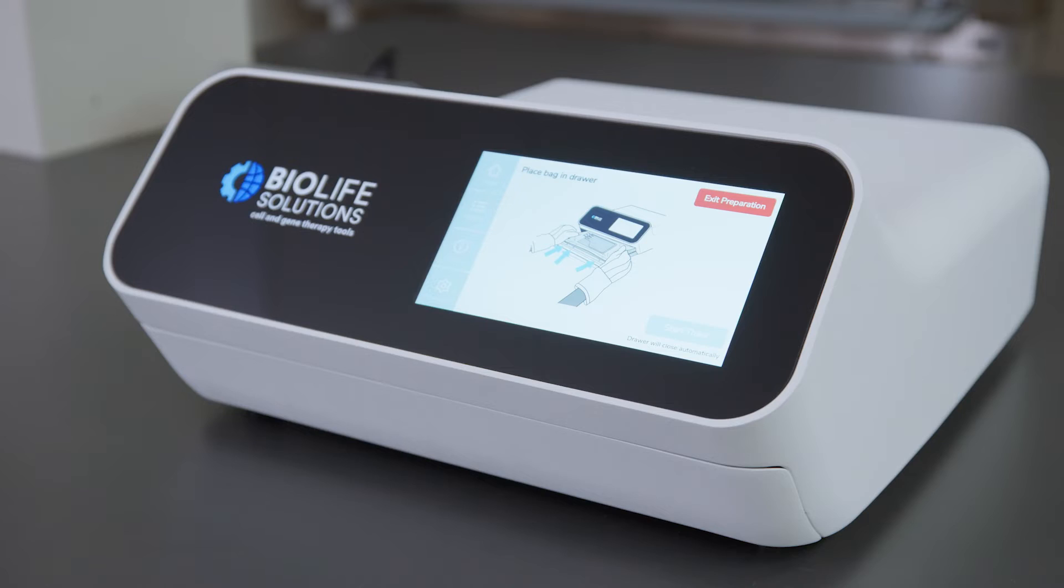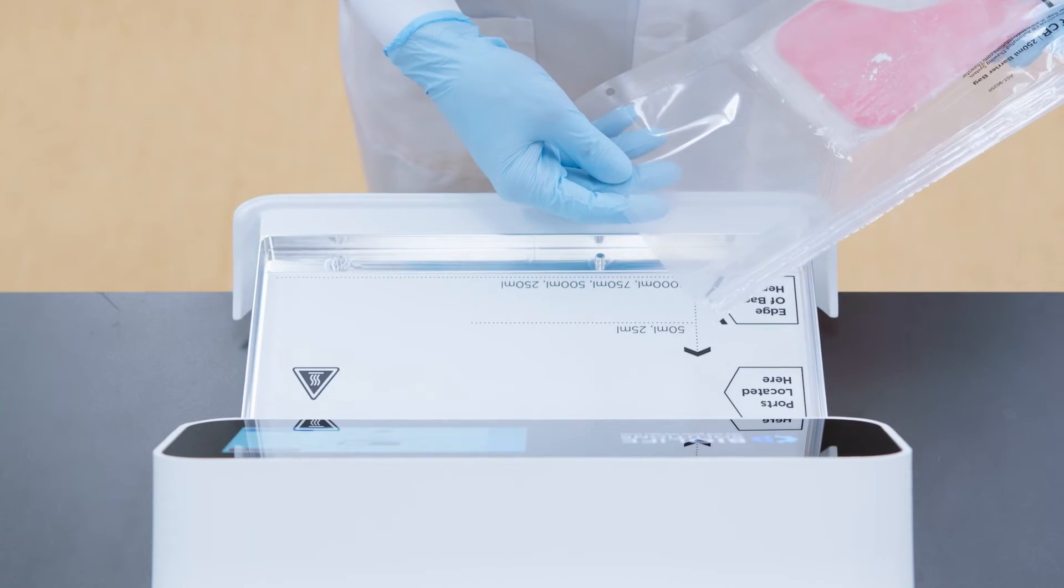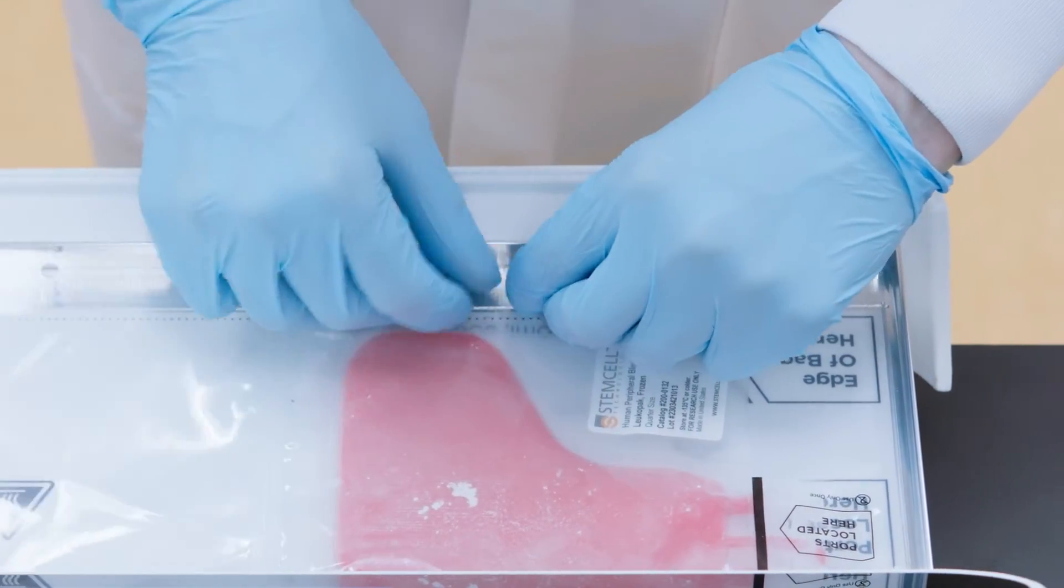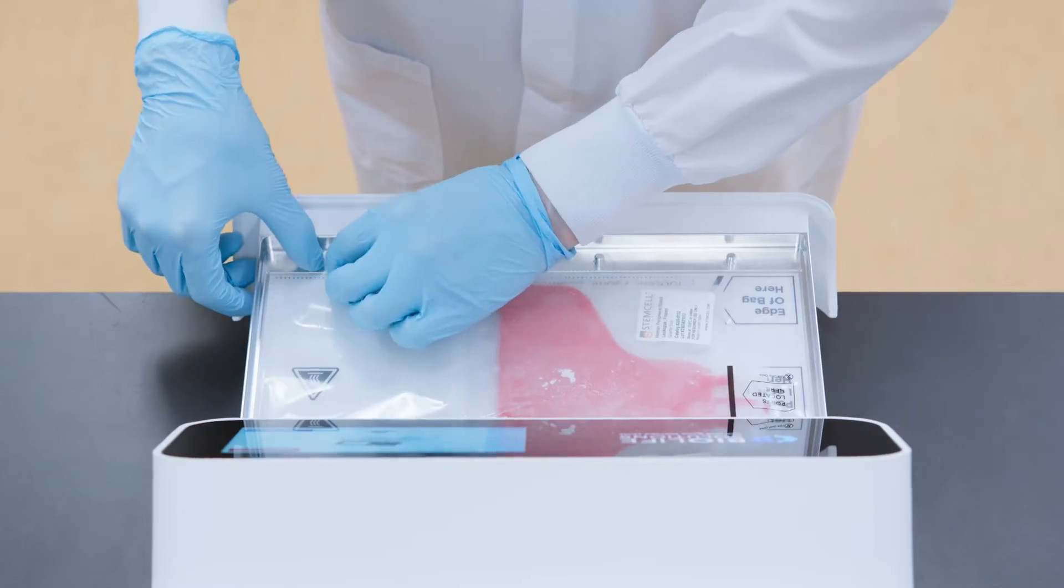When the instrument drawer opens, place the Thawstar CB barrier bag containing the frozen Leukopax into the drawer. Align the barrier bag's registration holes with the drawer guide pins to ensure correct positioning.